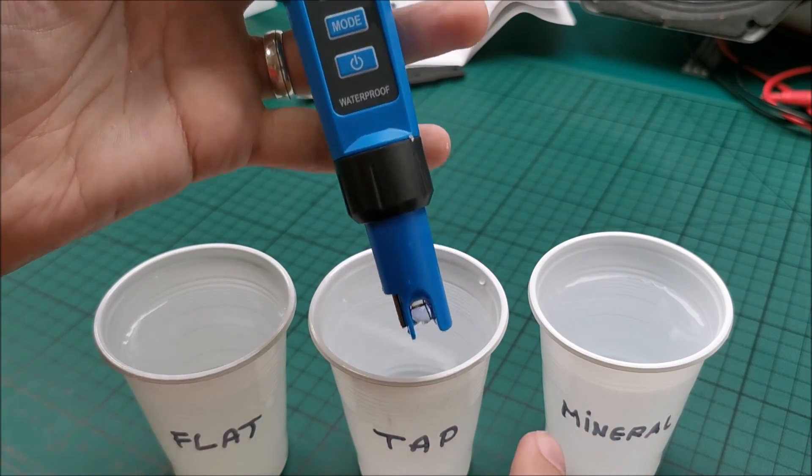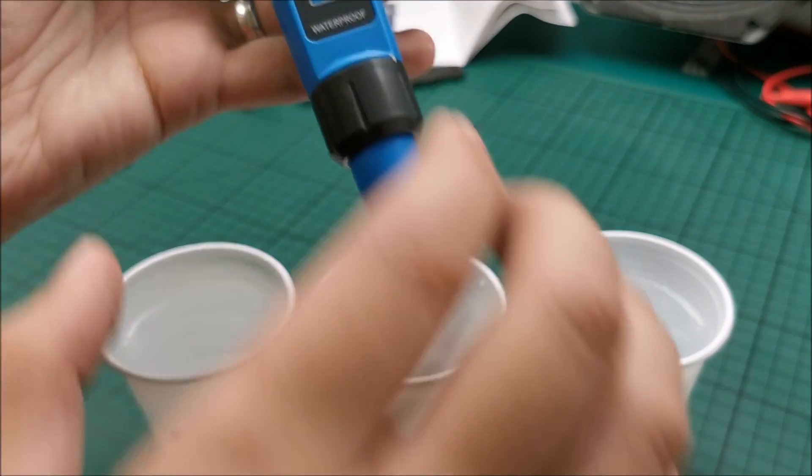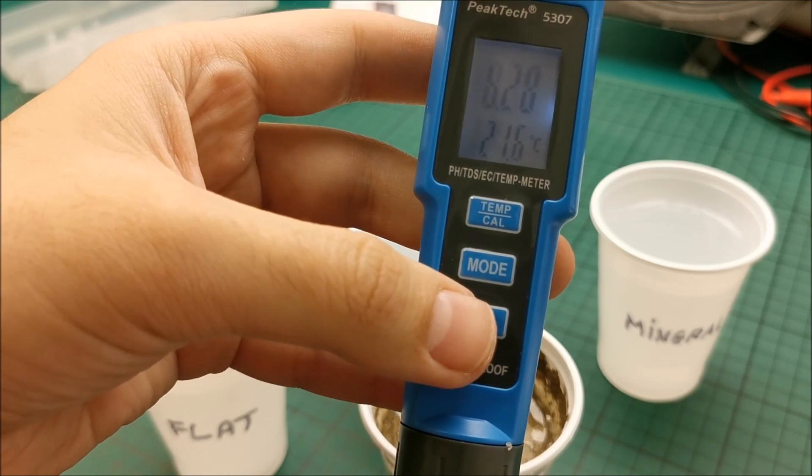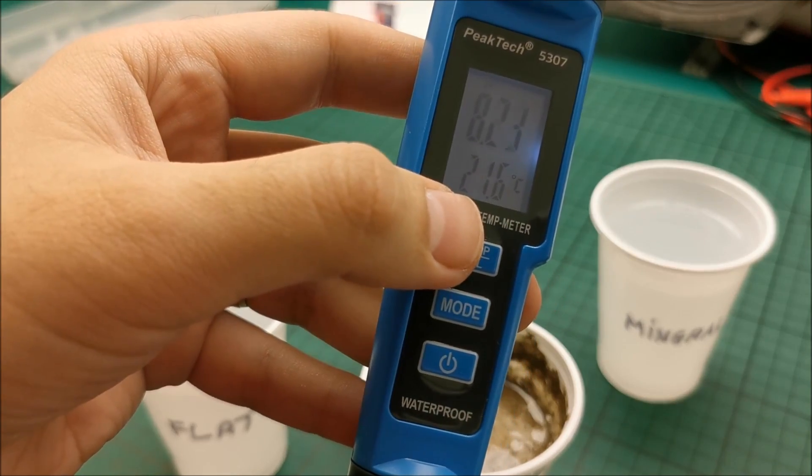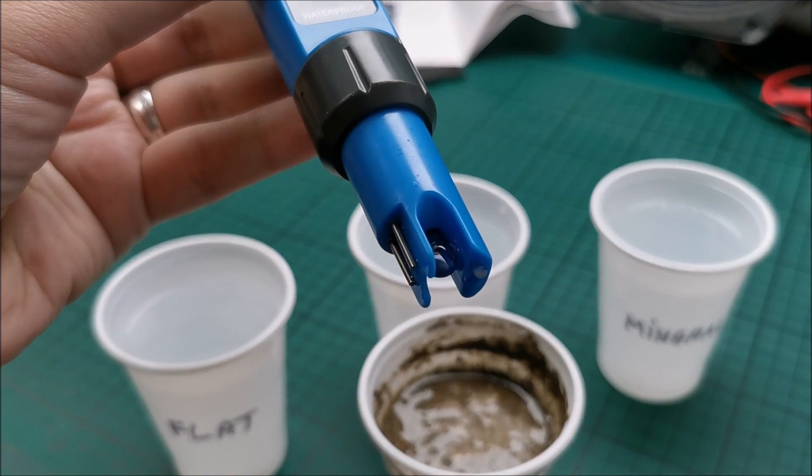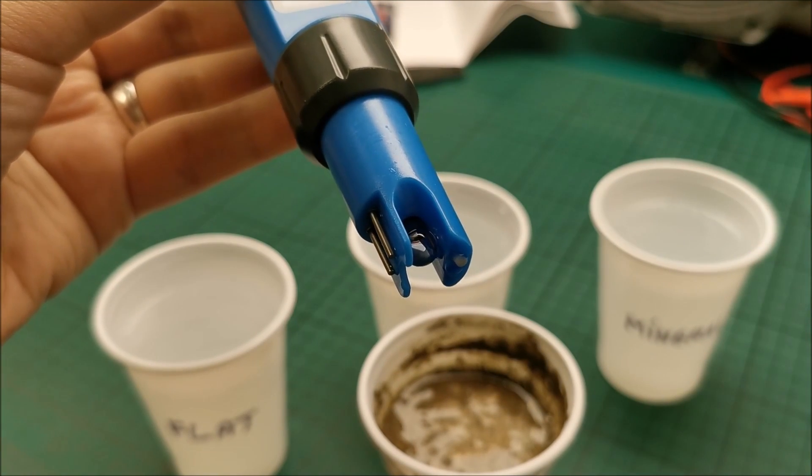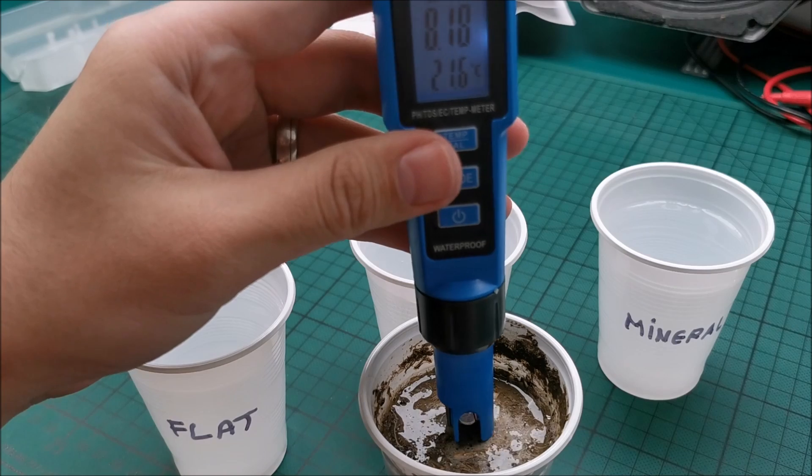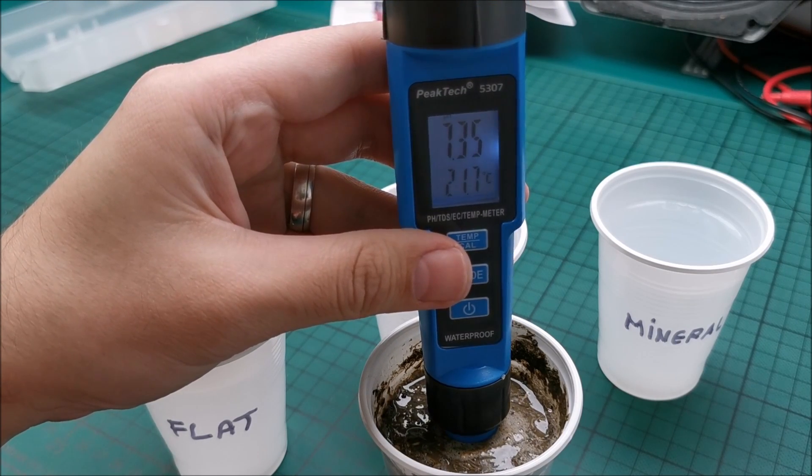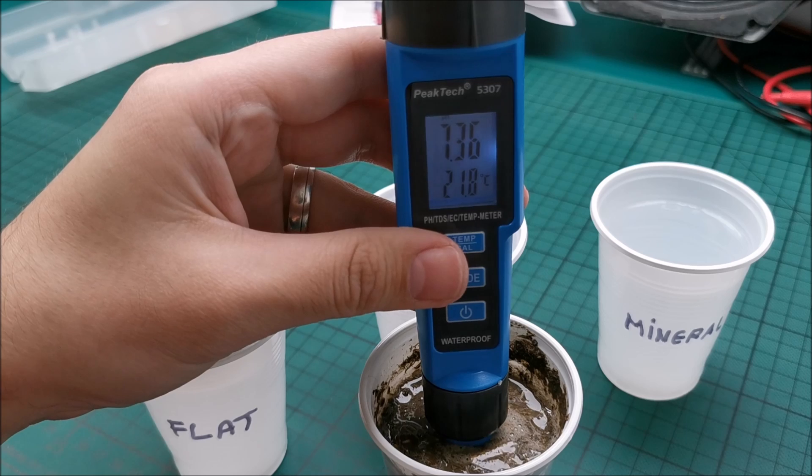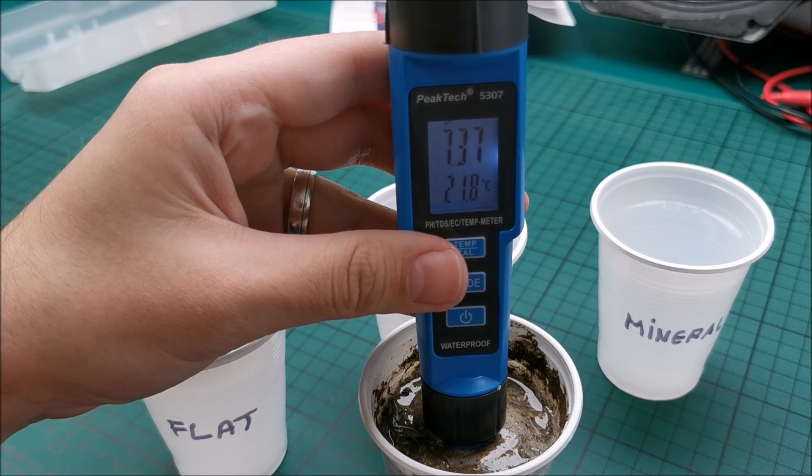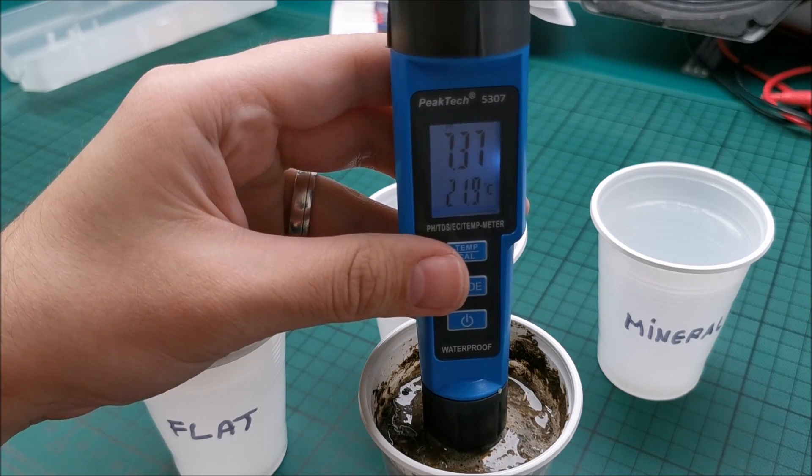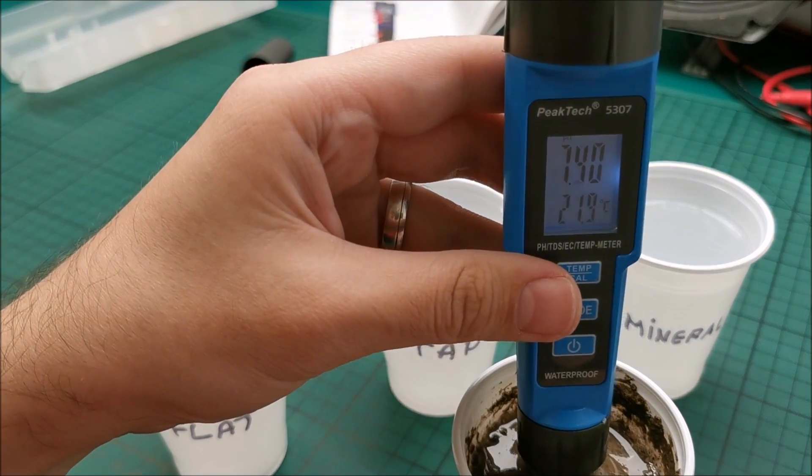Extra acid or how it's called the problems. This one, my tap water, could actually be better for him because you can see it's kind of starting maybe to neutralize a bit of the acid in his stomach, just a little bit. If I would measure vinegar or something like that, these differences would be way way bigger. It actually powered off by itself, so it has a timer. And the temperature is lower I think because it has water evaporating from it, so it's lower than the room temperature which does actually make sense because water uses heat to evaporate.